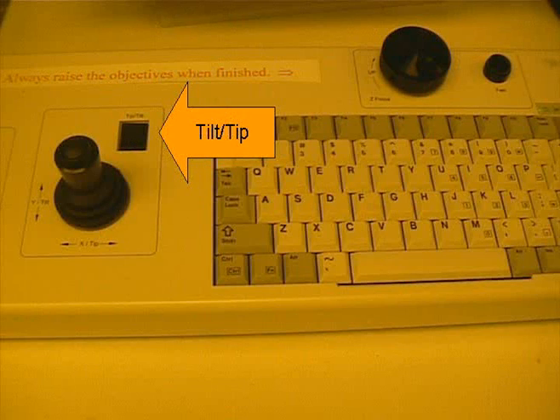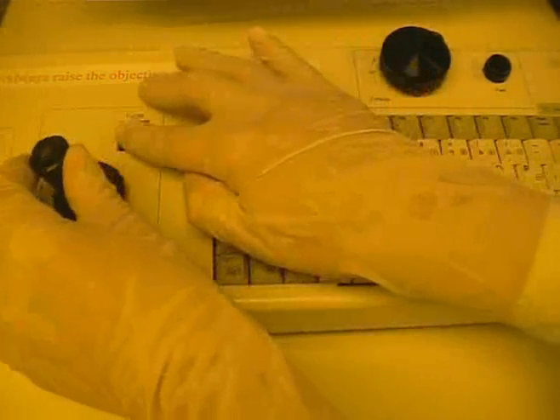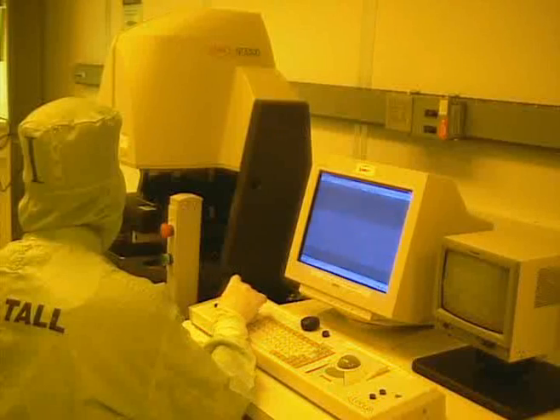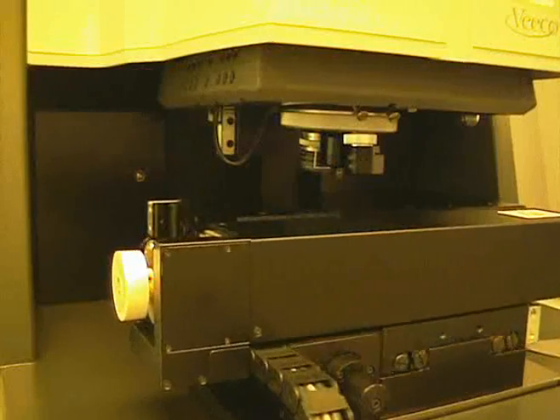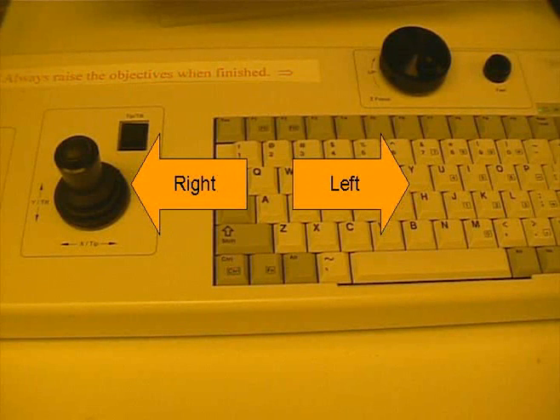We can tilt the objectives by pressing the tilt button and moving the joystick. This is how we can rotate the fringes or adjust the fringe spacing. We move the stage by moving the joystick. Pressing up on the joystick moves the stage out and vice versa. Pushing right on the joystick moves the stage left and vice versa. You can think of the joystick as actually moving the objective lens.